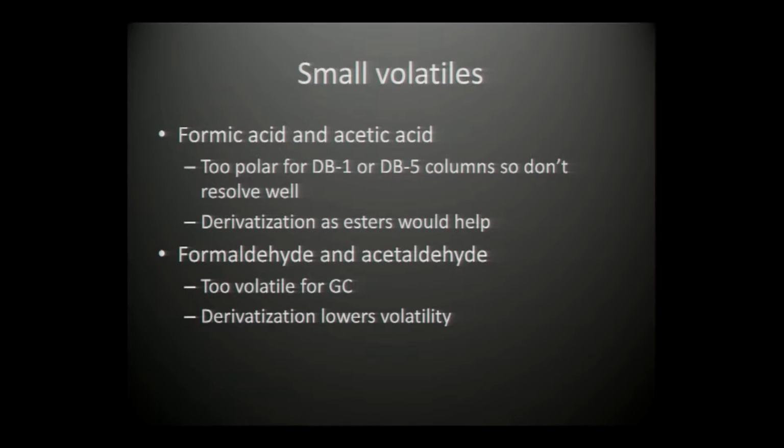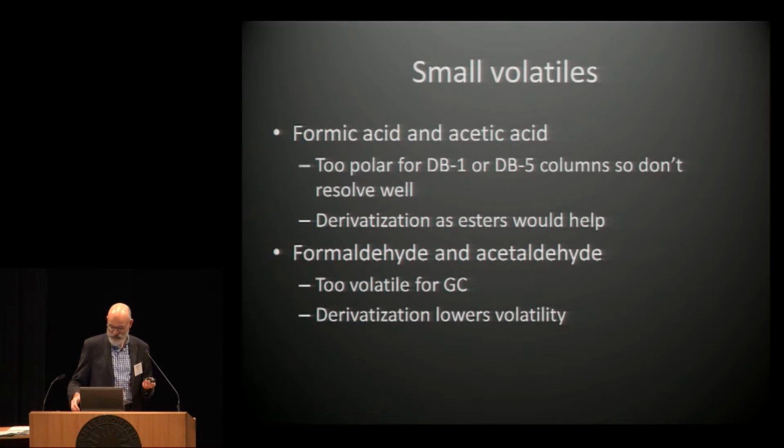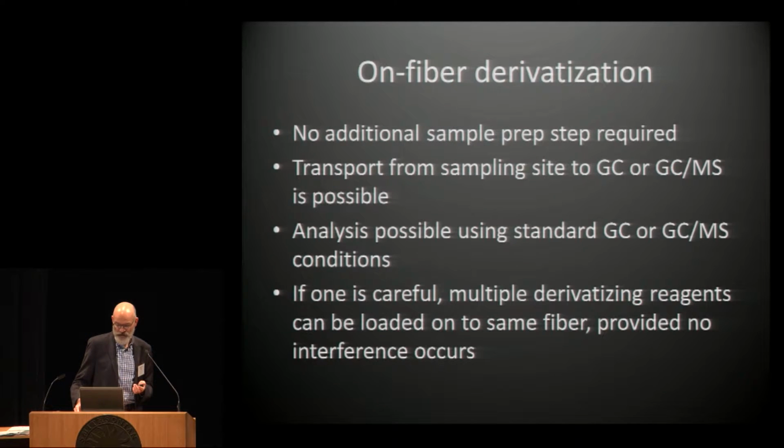However, formaldehyde and acetaldehyde, even though they might be in your sample, are too volatile to stick to a straight SPME fiber, and you can't then get them onto the GC. So derivatization in both cases, changing these molecules to something else that is less volatile and or less polar, will help in the analysis.